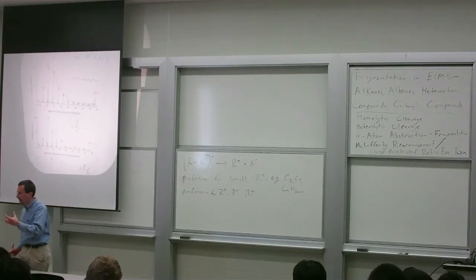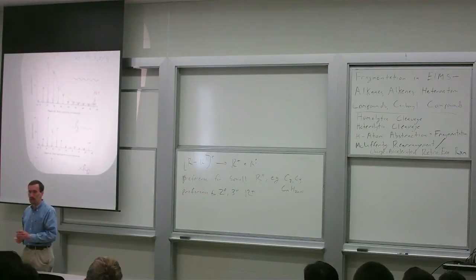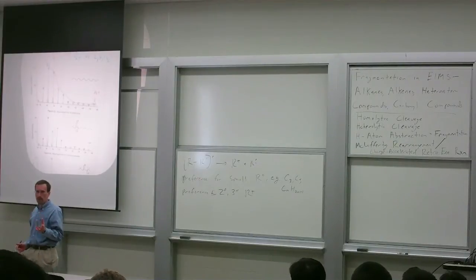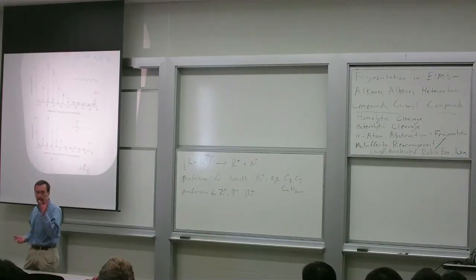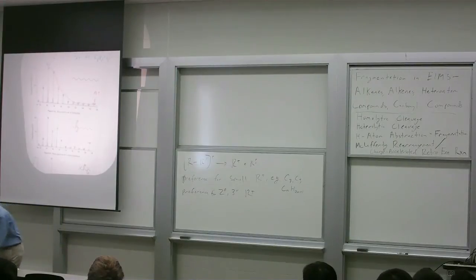Charge is being stabilized partially by hyperconjugation, but partially also by delocalization over the carbocation. So by the time you get down to an ethyl carbocation, it really is very unstable. Plus, you get further rearrangements. These molecules are very hot, so chances are what we're seeing at 43 is not necessarily an n-propyl, but actually an isopropyl carbocation. In other words, you may initially form a propyl cation, and then with a 1,2 hydride shift, either concurrent or sequential, get an isopropyl carbocation.